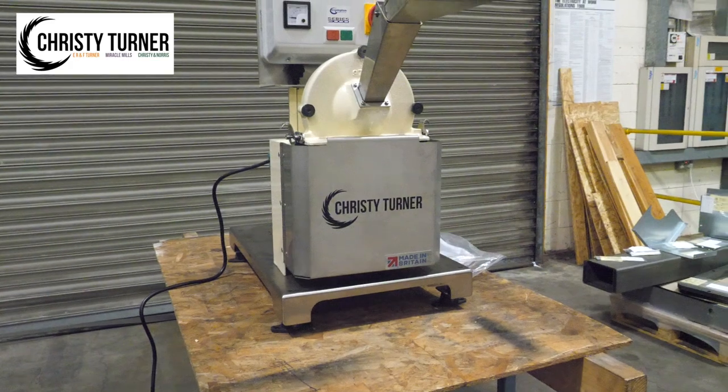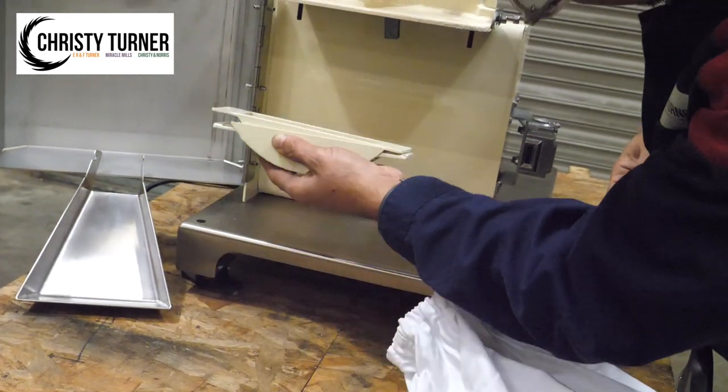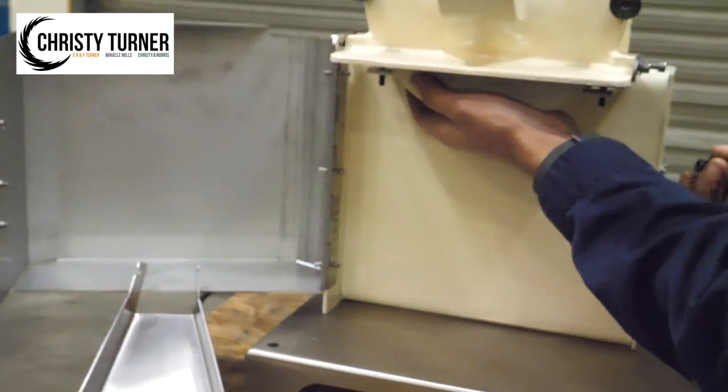The 1.5 kilowatt electric motor powers a Betacross at 8,000 rpm. This sits above a curved screen which can easily be replaced. This screen provides one of the essential safety features of the lab mill.